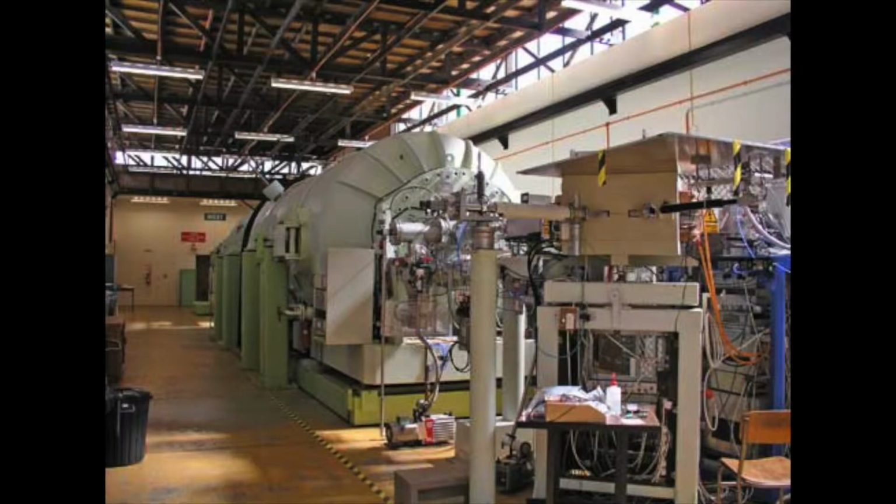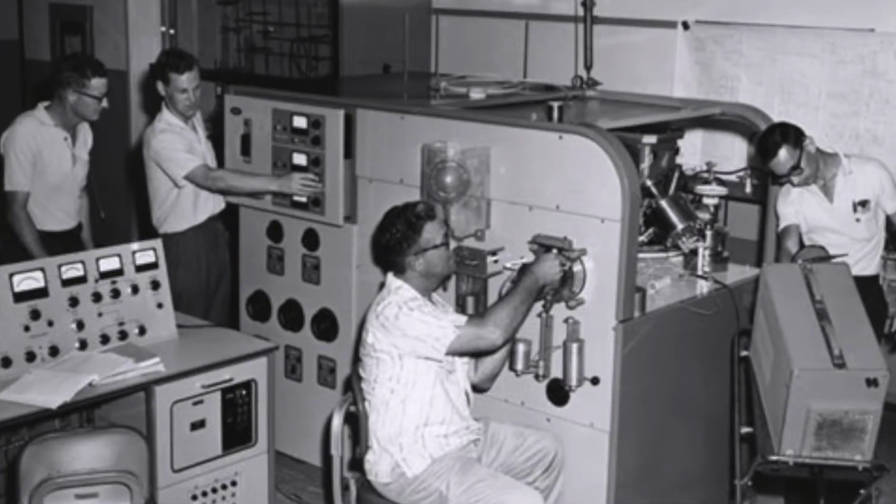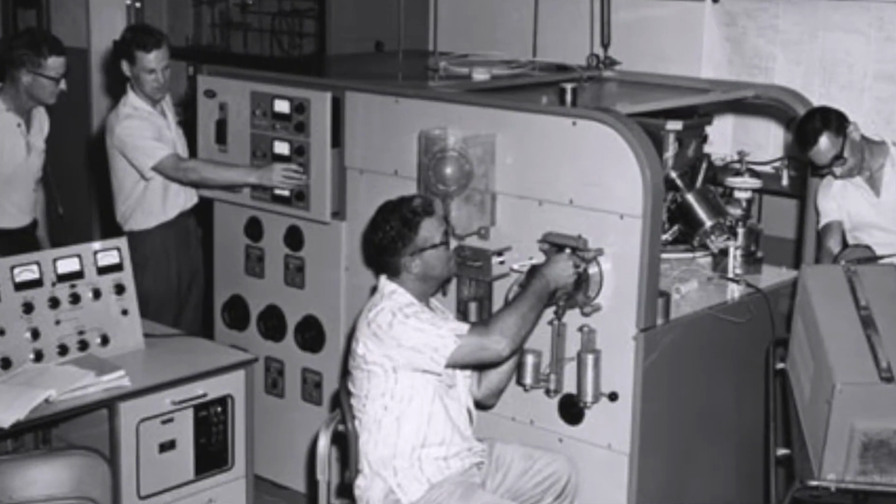It has helped decrease the amount of time spent trying to identify an ion through its weight alone, as it took far longer to find out the weight before the mass spectrometer was invented.